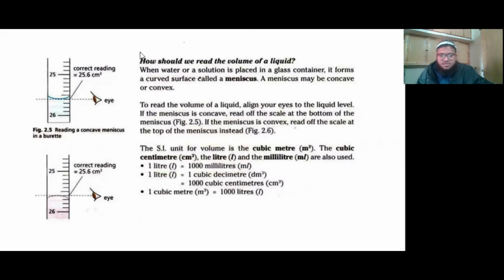This paragraph over here has been taken from your book Chemistry Matters. You might have come across that book. It's a beautiful book, especially for your chemistry. Let's see what they say in this paragraph. How should we read the volume of a liquid? Let's quickly read through it.